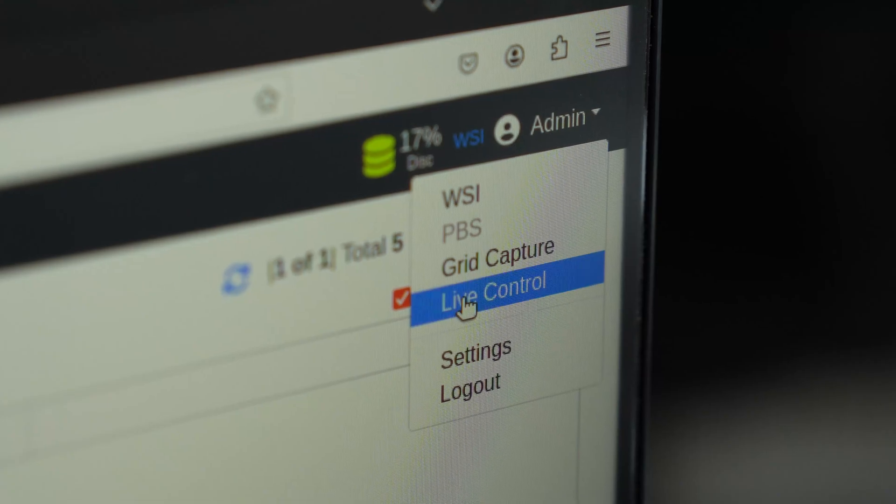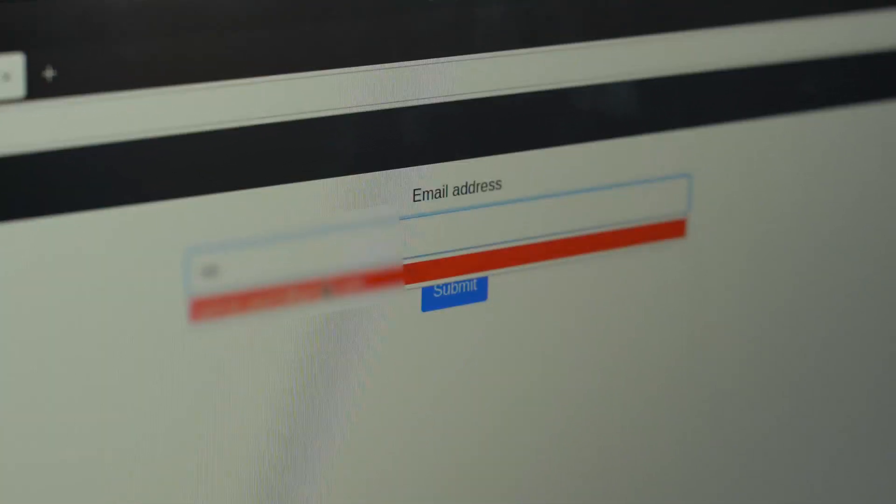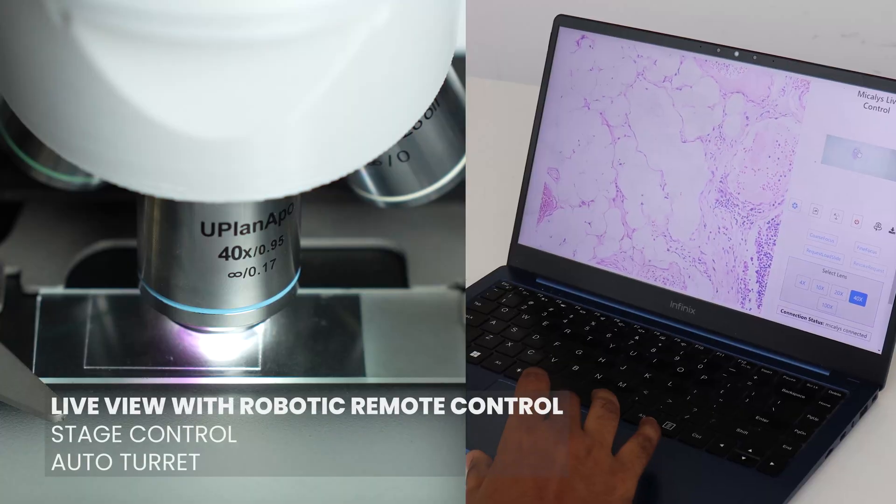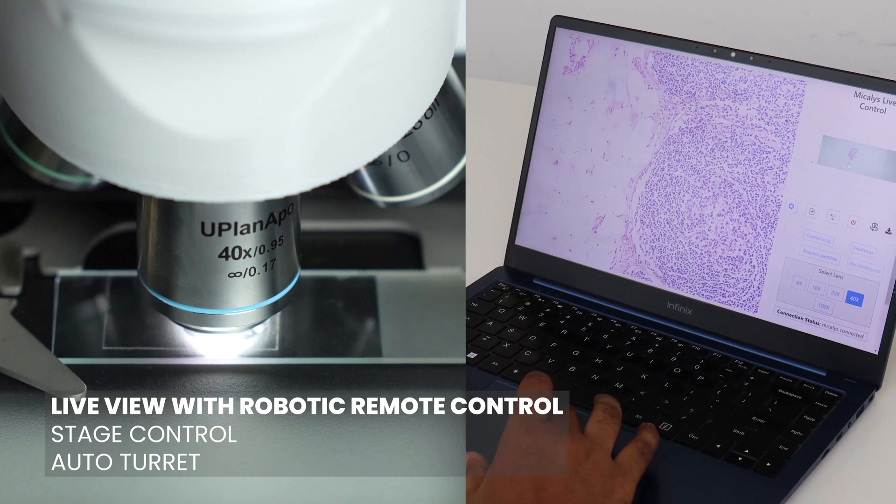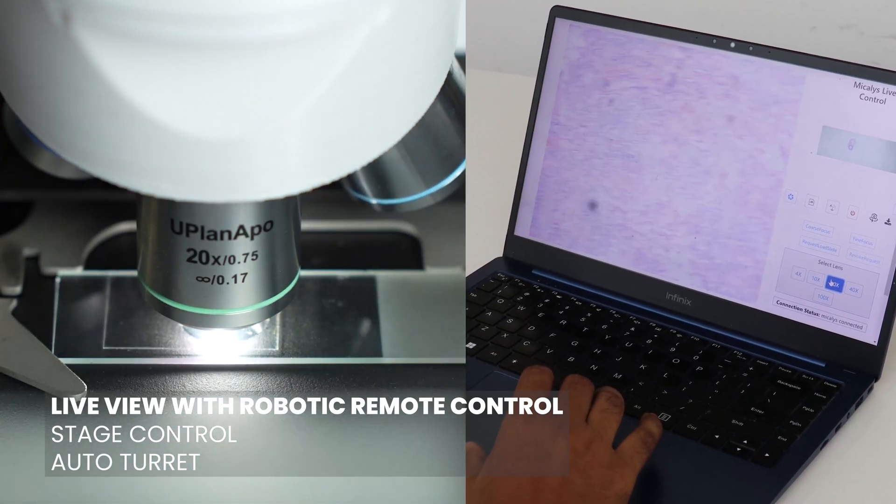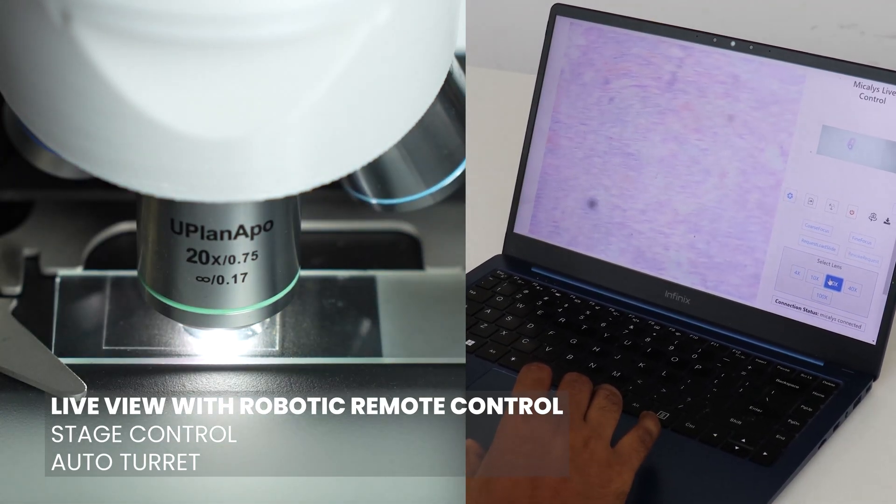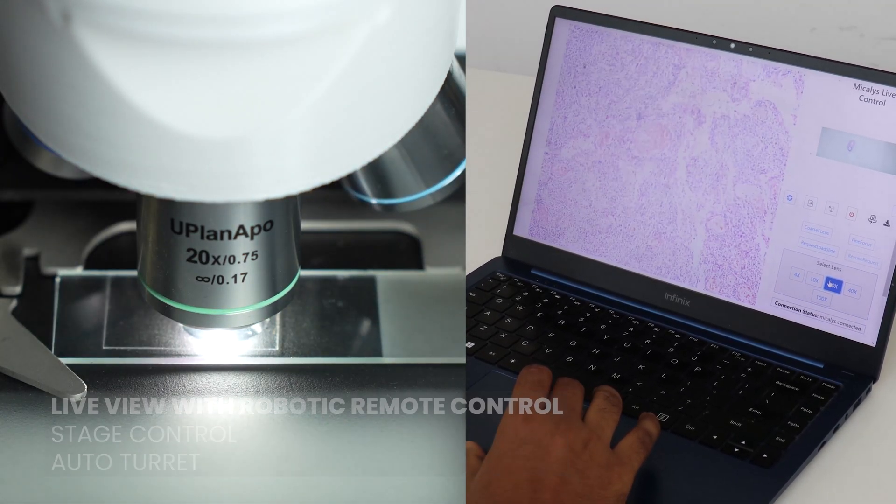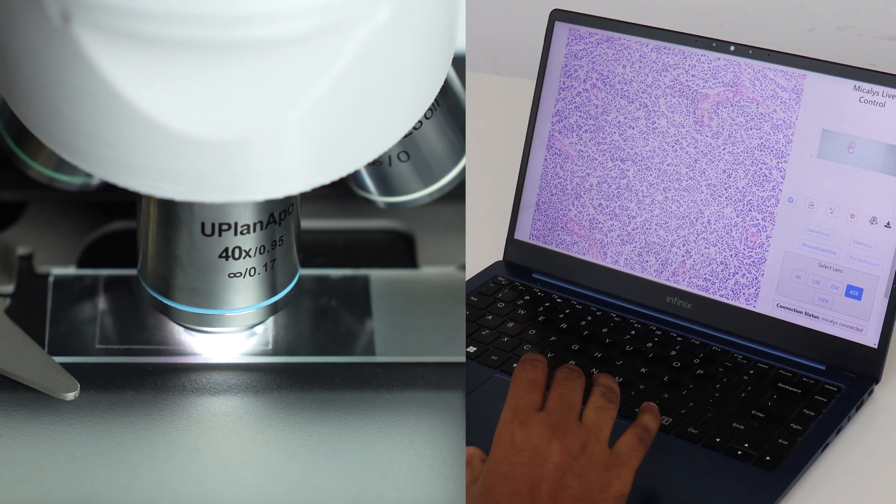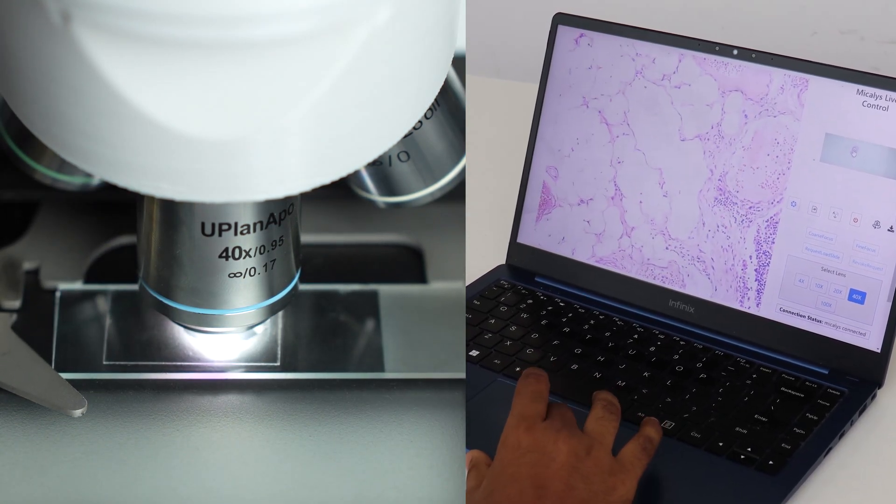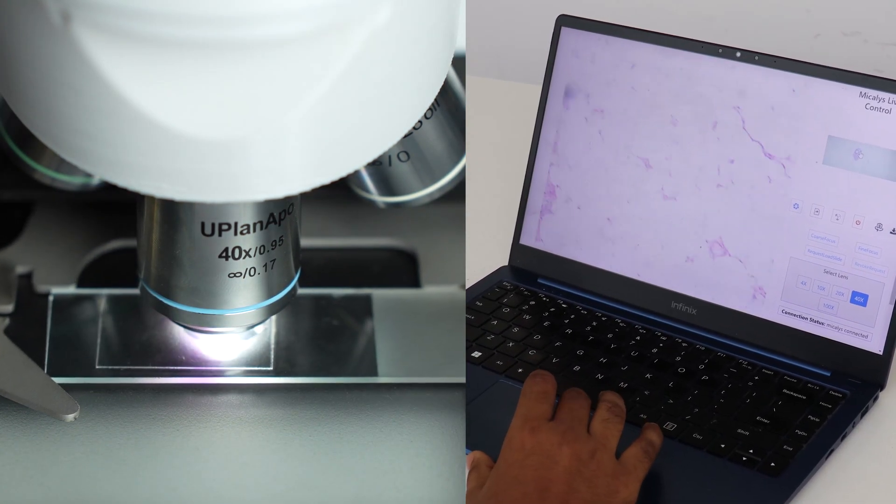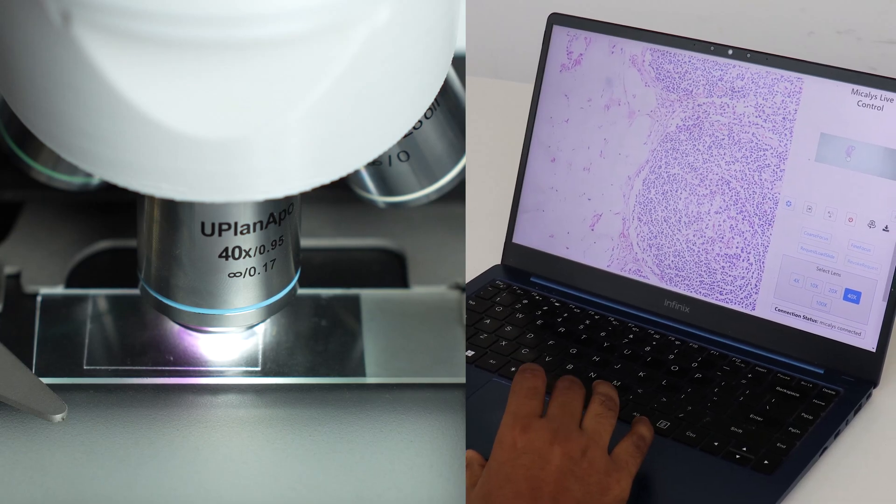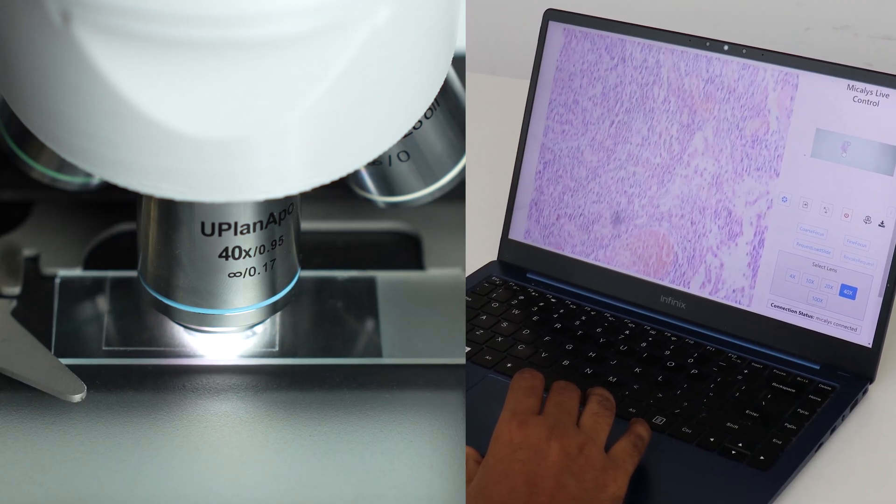Experience more than just a live view with Michaelis. Gain unprecedented control as you remotely manage the microscope stage, focus and magnification, all with an astonishing latency of just 250 milliseconds. Whether you are across the room or across the globe, immerse yourself in the microscopic world with unparalleled precision and responsiveness.